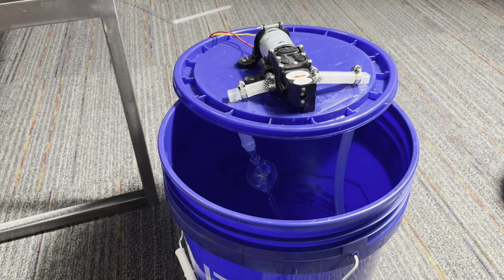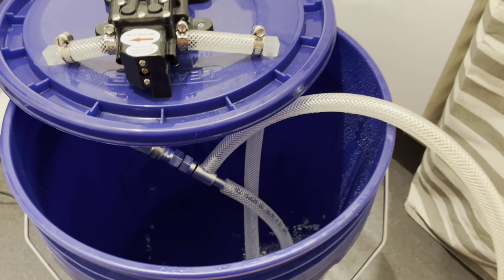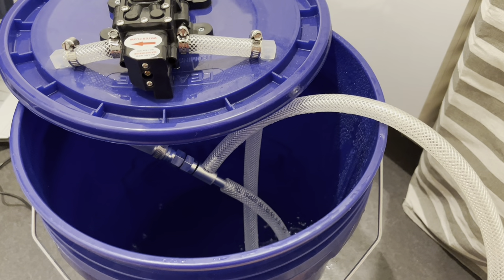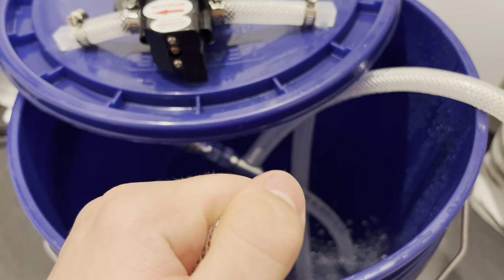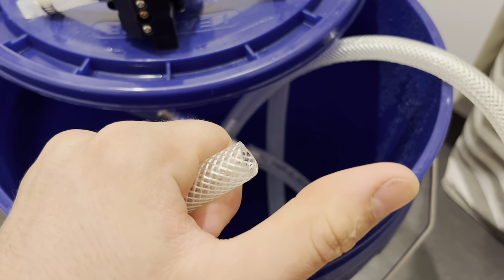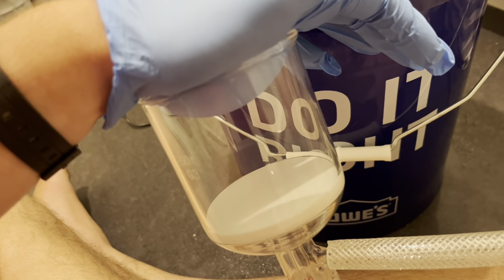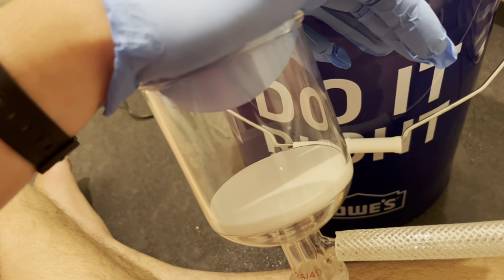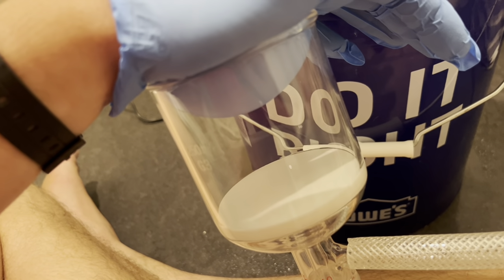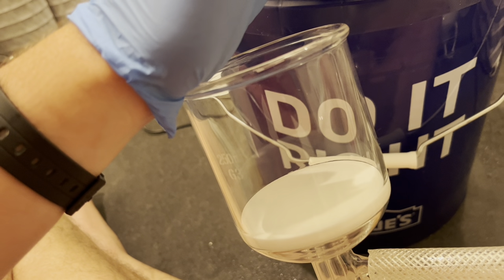It could maybe be used for something like a vacuum filtration, but as far as distillation is concerned I wouldn't even consider it. The last water aspirator I tested was a metal version of the 3D printed model, and it worked the best. After confirming that I was producing some sort of vacuum with my finger, I moved on to something fun — I put a gloved hand over a Buchner funnel and watched my glove slowly get sucked into it. This brought back memories of being in college organic chemistry lab where my entire glove got sucked in. This shows that while it did produce a vacuum, it wasn't quite as strong as the ones available in my college lab.